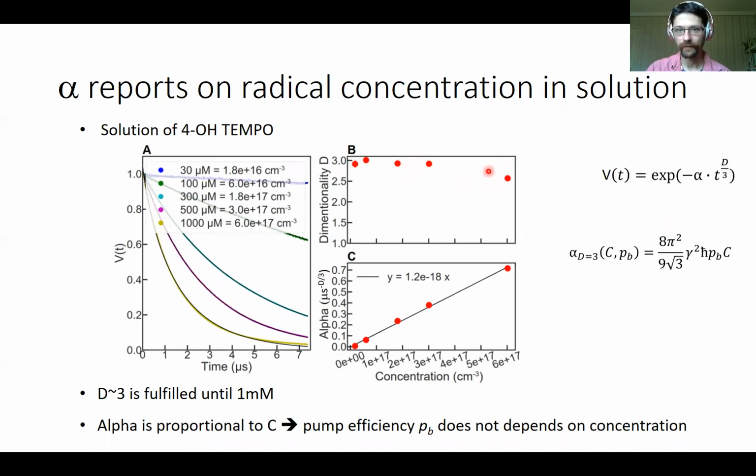And here you start having deviation at high concentration, and this is because of excluded volume, where because you're too crowded, your tempo can't overlap. So you actually break your assumption of a random distribution. Therefore, you break this equation, and you can see the fit here for this high concentration actually doesn't fit very well.